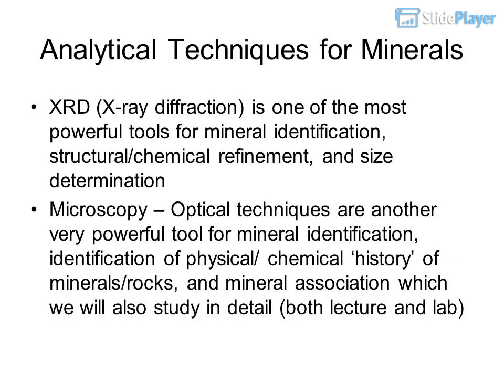Analytical techniques for minerals. XRD, X-ray diffraction, is one of the most powerful tools for mineral identification, structural and chemical refinement, and size determination. Microscopy and optical techniques are another very powerful tool for mineral identification, identification of the physical and chemical history of minerals and rocks, and mineral association, which we will also study in detail, both in lecture and lab.